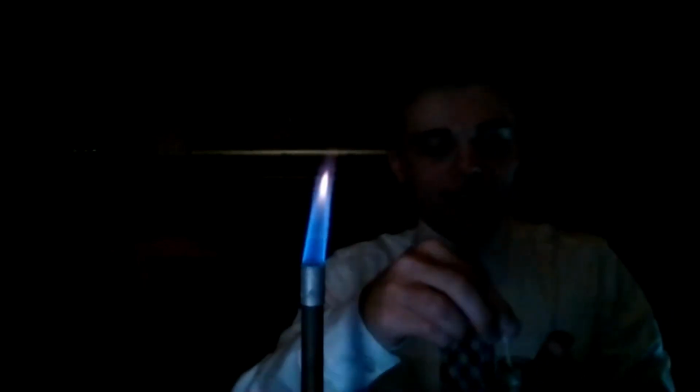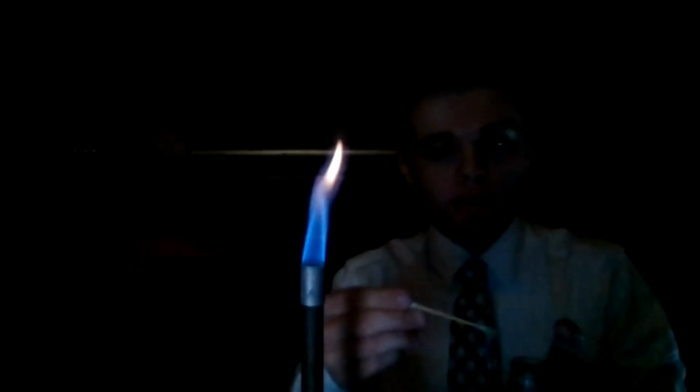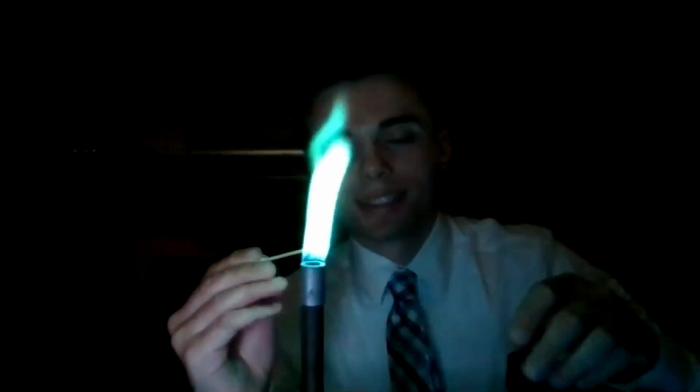Someone just copper. Oh, copper's one of my favorite ones to do. Okay, so copper. We're going to put some copper on the Q-tip. Are you ready for this one? Look at that. Isn't that cool?